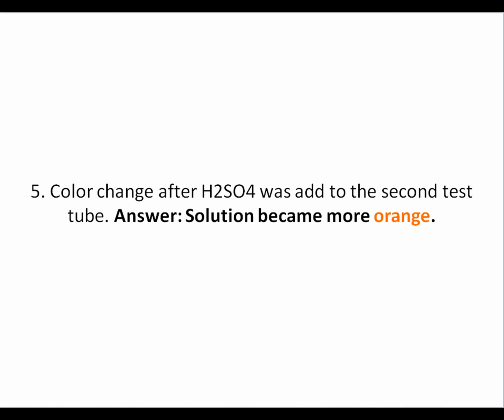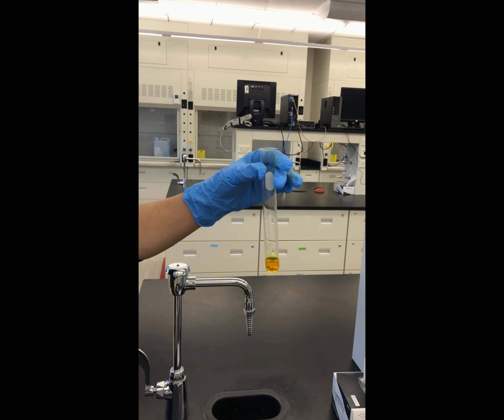Number 5, color change after H2SO4 is added to the second test tube. The solution should become more orange.